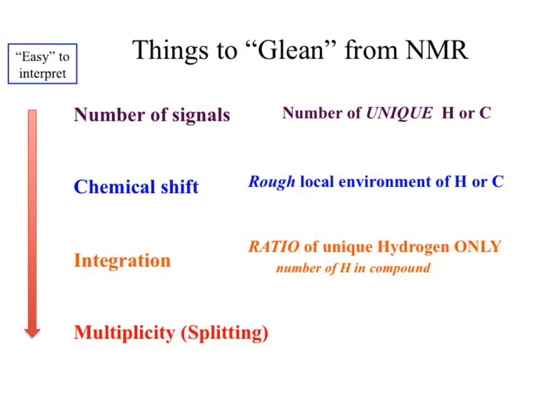Well, hydrogen makes up 99% of all of the isotopes for hydrogen, protium. That's the one that we're actually detecting. When we move to carbon NMR, we're looking at carbon 13, which makes up about 1% of all of the possible carbon. We don't get enough carbon in there to do some weighting information with our integrations. Too random to do any effects on, so don't look at integrations when it comes to carbon NMR.